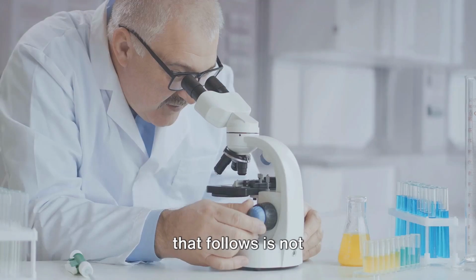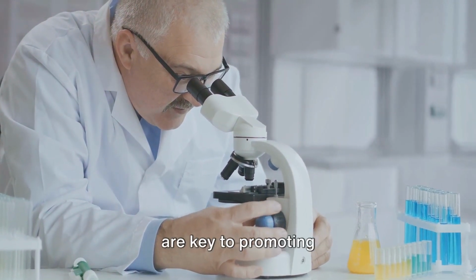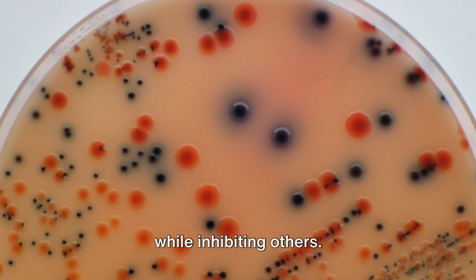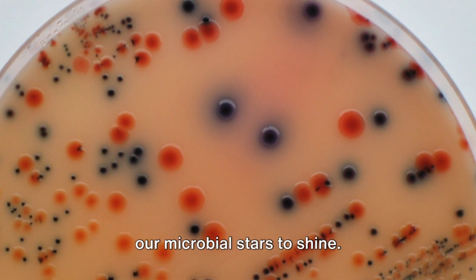The incubation period that follows is not just a waiting game. Specific incubation times and temperatures are key to promoting the growth of particular organisms while inhibiting others. It's a bit like setting the stage for our microbial stars to shine.